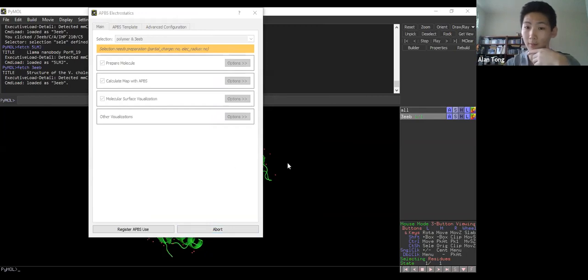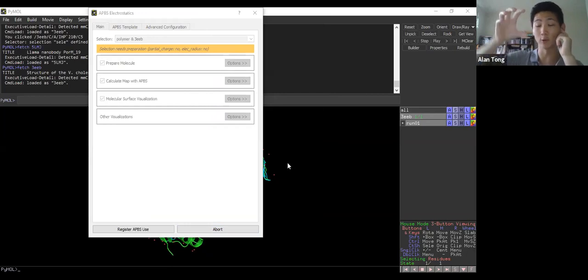So Mavi says, what does it mean for amino acids to be positive? Yes, so positive charge. Things like arginine, lysine, histidine. You can change the properties of amino acids in order to manipulate the structure and the functions and properties at certain locations. So this is calculating the electrostatic surface, and we're waiting on this computation to take place. What you'll notice is a very distinct binding pocket, all right?